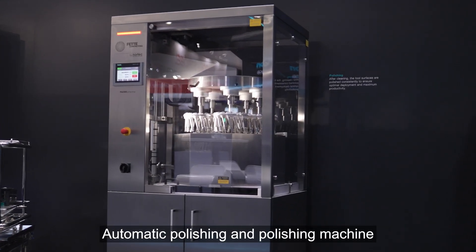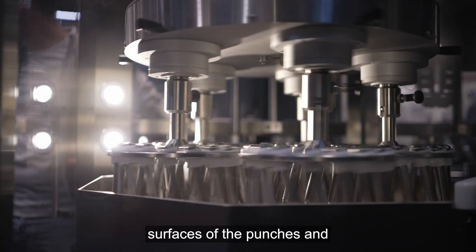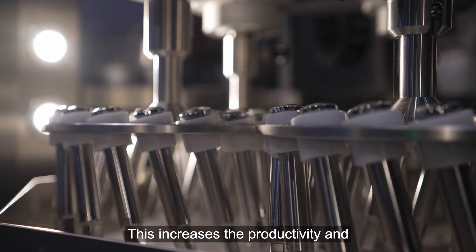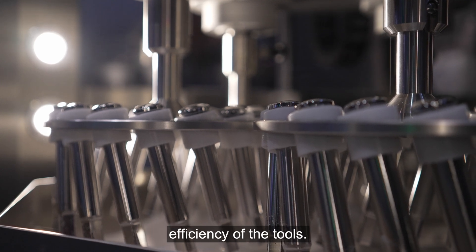Automatic polishing in a polishing machine ensures that the surfaces of the punches and dies are polished evenly. This increases the productivity and efficiency of the tools.